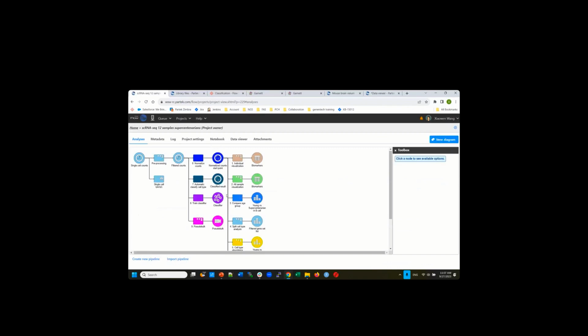And after this is done, you have this trained classifier. You can publish the classifier and use it for a different project, or you can go to your data node and say, hey, I want to classify my cell type, and I don't have a managed classifier in my library, but I want to use the one I just built for this project.